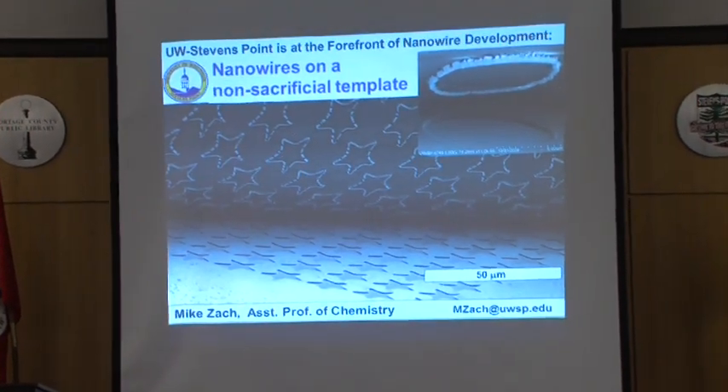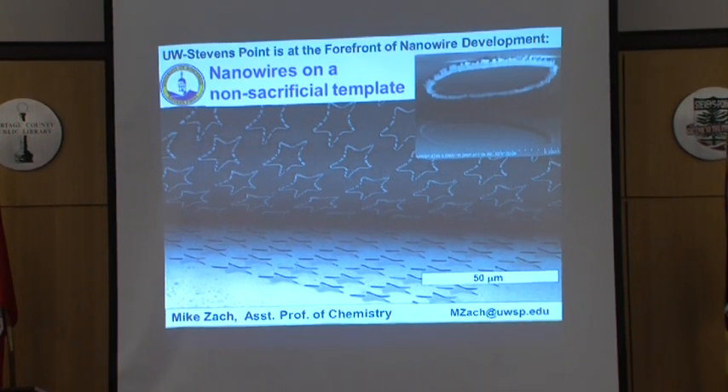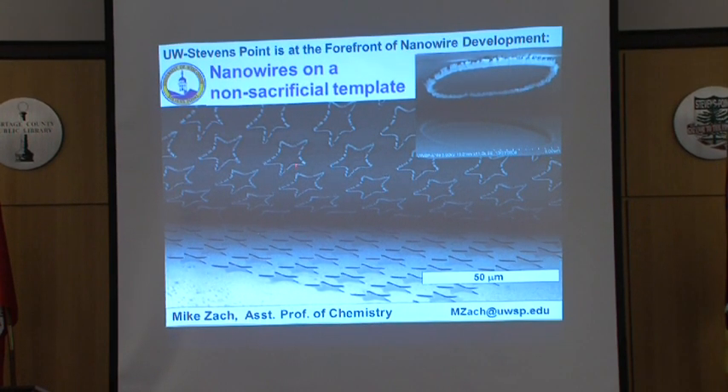These wires here are rather broken, and the reason why they're broken is that in order to get this view right at the peeling interface, we really had to bend that layer of polymer back very sharply, pulling and stretching it — that's why the wires are broken. But if we remove these in the normal way, the wires are all completely intact.